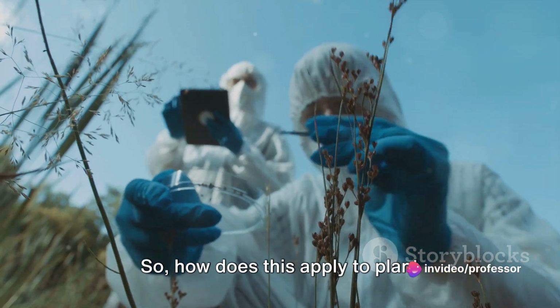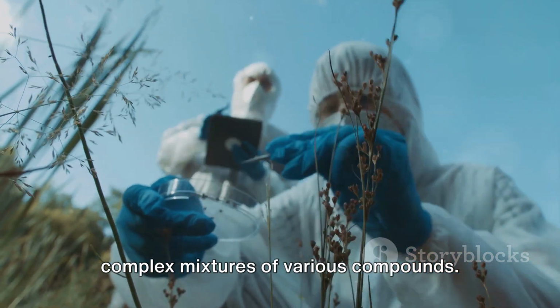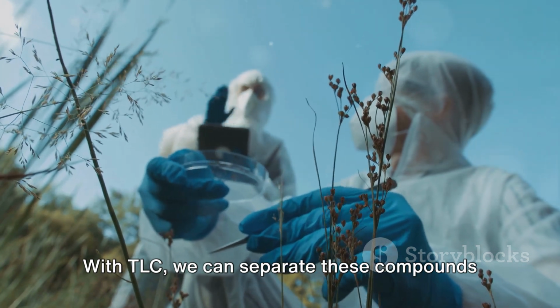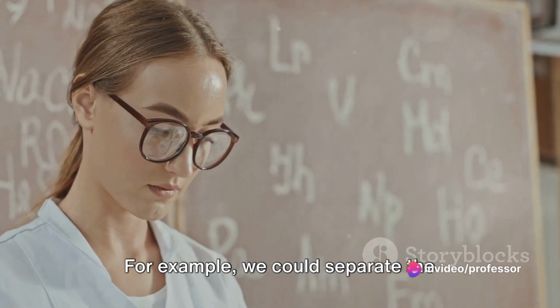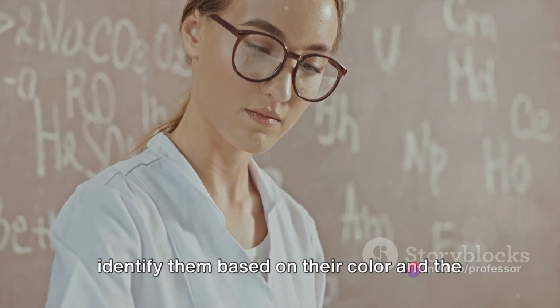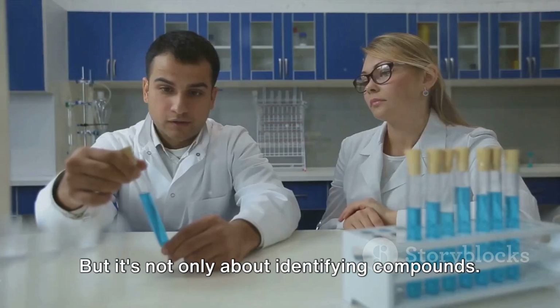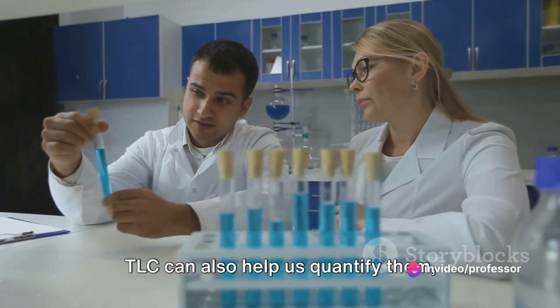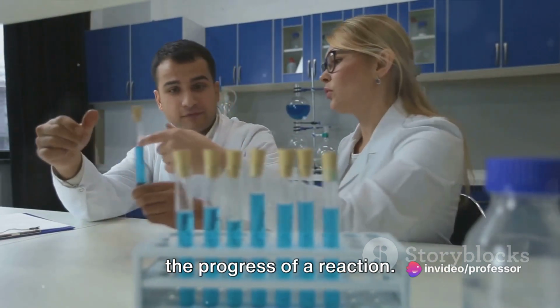So, how does this apply to plant compounds? Well, plant extracts can be complex mixtures of various compounds. With TLC, we can separate these compounds and identify them based on their unique properties. For example, we could separate the various pigments in a leaf extract and identify them based on their color and the distance they traveled on the plate. But it's not only about identifying compounds. TLC can also help us quantify them, determine their purity, and even monitor the progress of a reaction.